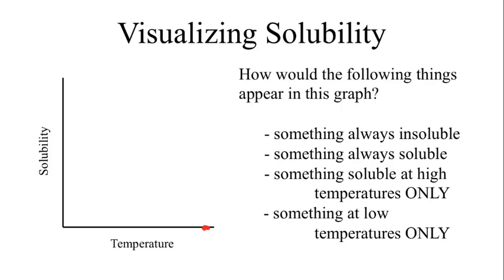Low solubility, not a bad idea, except I'm not on the solubility curve. I'm only on the temperature curve. So let's look at the temperature. Temperature's increasing in that direction. That's probably a high temperature. Or if we want to get really scientific with it, we can call it hot. Just like Paris Hilton.